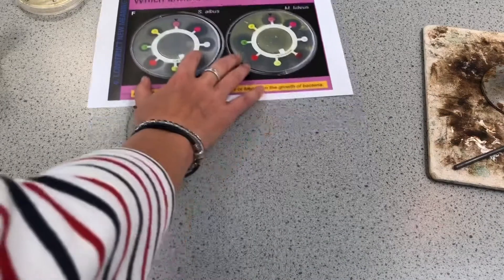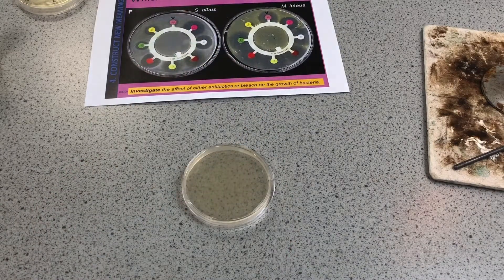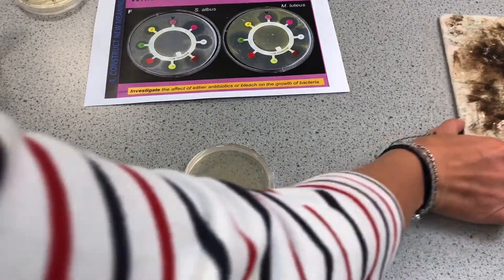So we've got our plate — it's upside down. It's got that nutrient agar jelly in it, which is full of nutrients to allow the E.coli to grow, and it's completely sterilized. It's been heated to a high temperature until it became liquid, then poured into the plates and kept in the fridge.